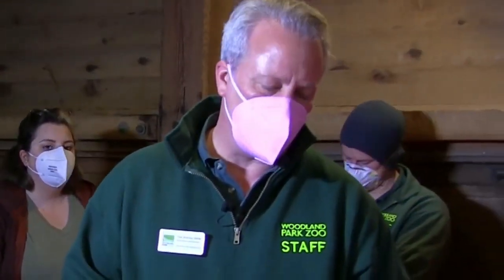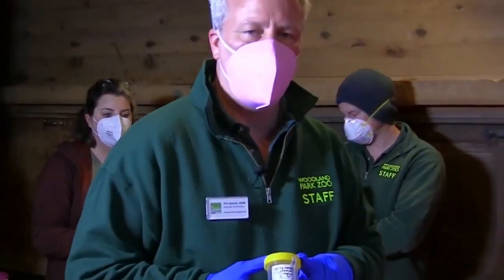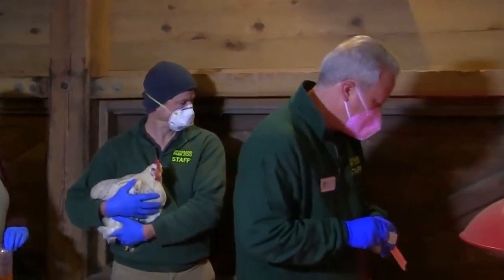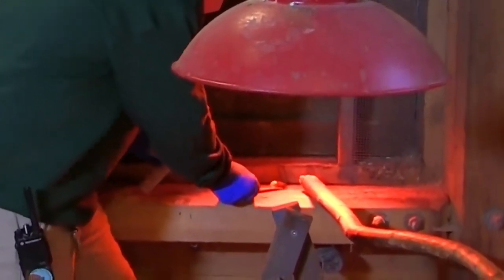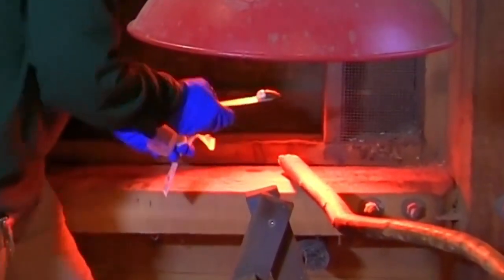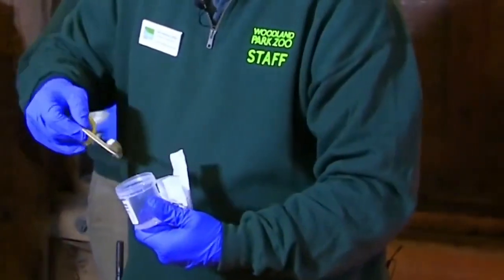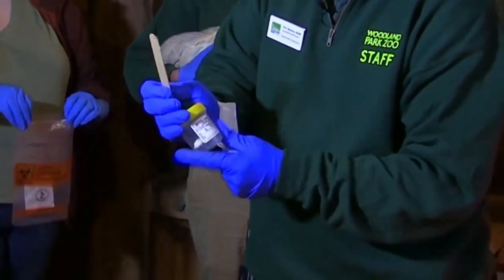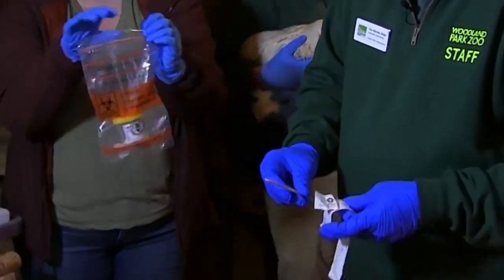Next, I'm going to take a sample of the chicken's feces using a sterile tongue depressor and a pre-marked container labeled with the animal's name and the date. I have a sample of feces over here on the ledge. Put that in the sterile container, seal that up, and then we're putting that in a shipping envelope to go to the laboratory.